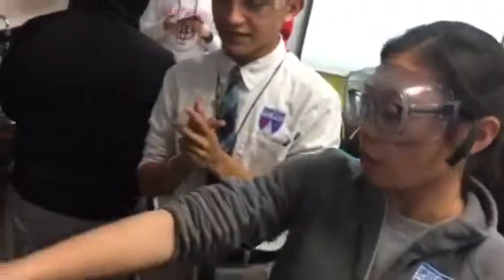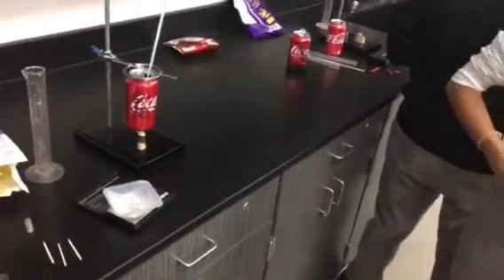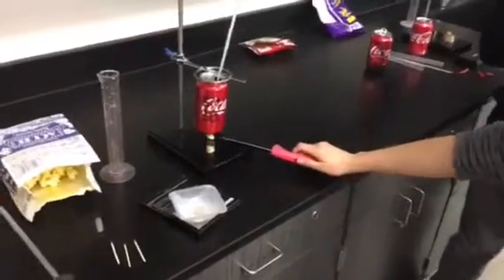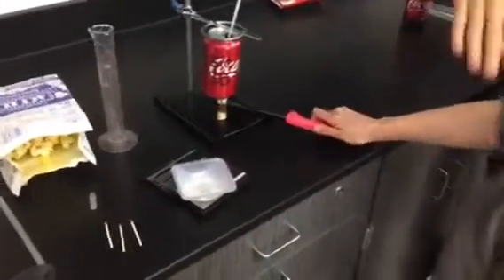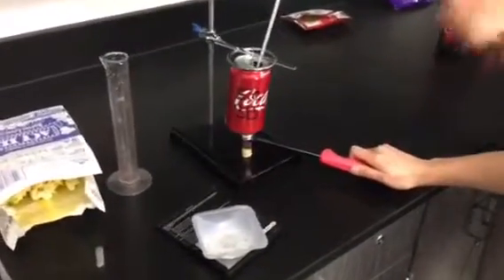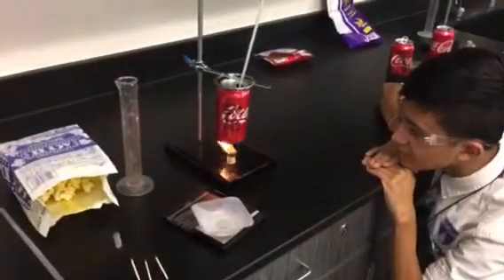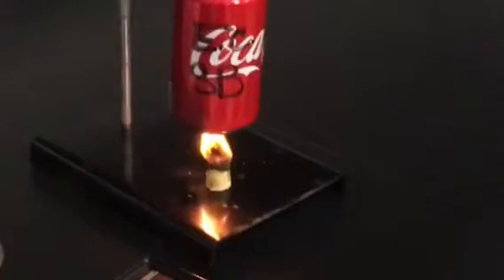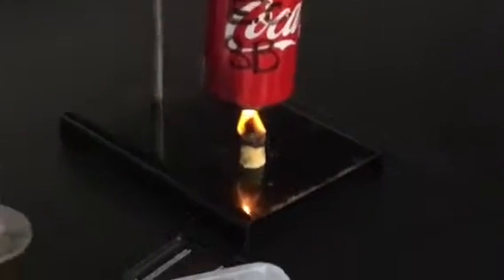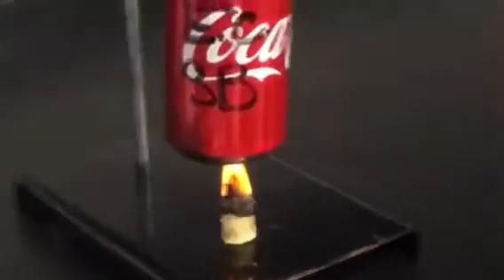I'm going to do the initial light, and those matches are there for you to catch it if it ever goes out. If you don't end up using your matchsticks, that's okay. If it ends up burning the whole thing, then you don't need to use them. You can see the fire activity. It's going to keep burning. Well, we need the temperature. The fire's dying now, until the whole fire stops.